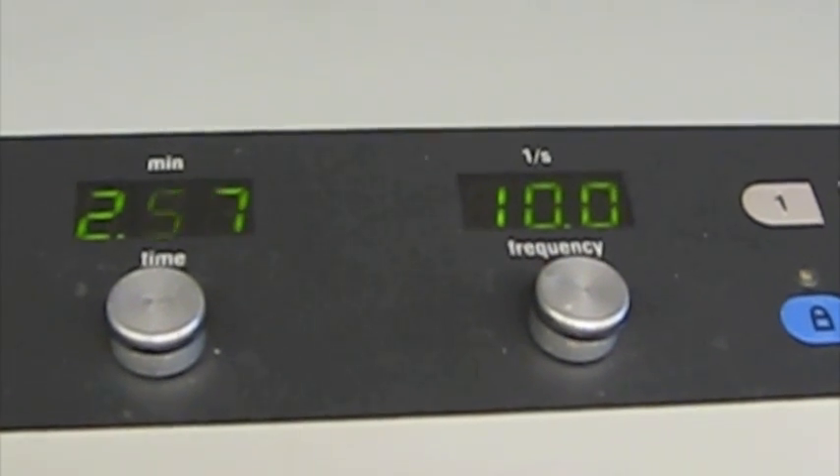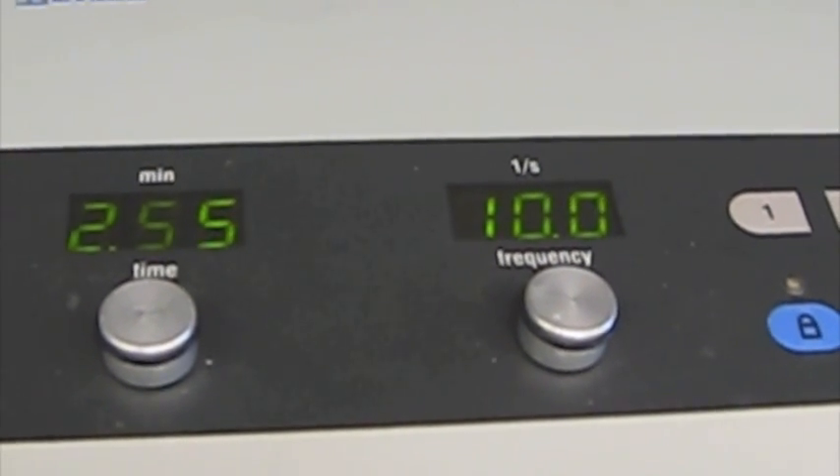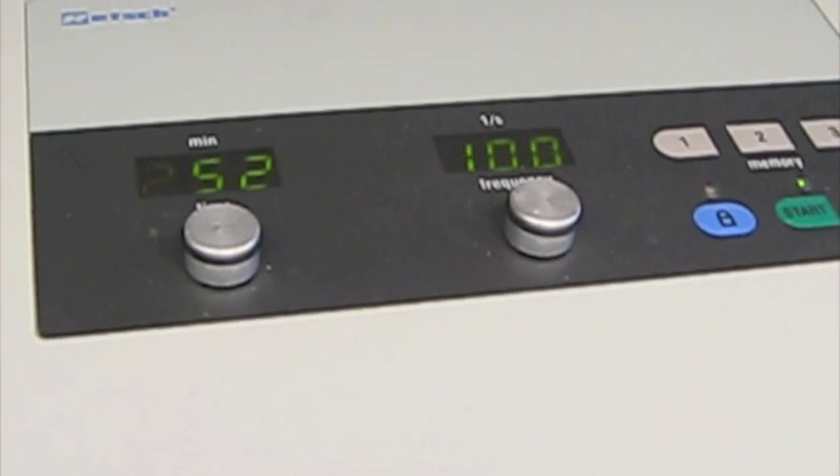Here we're doing 10 hertz for 3 minutes. We're going to do that 5 times with 2 minutes of cooling in liquid nitrogen between each run.